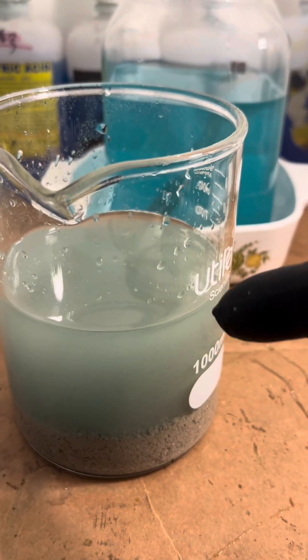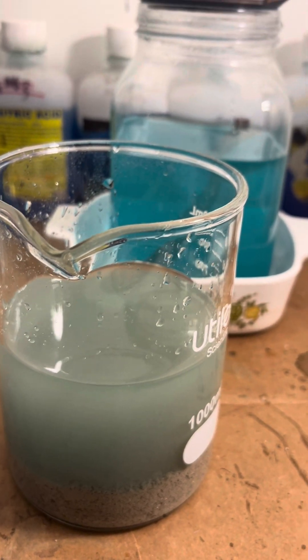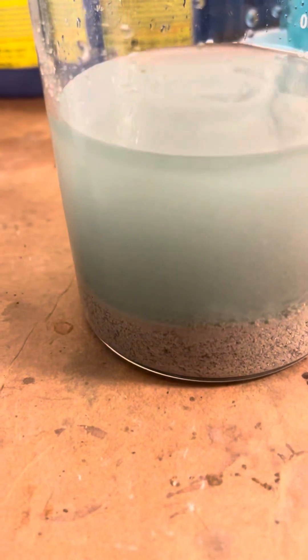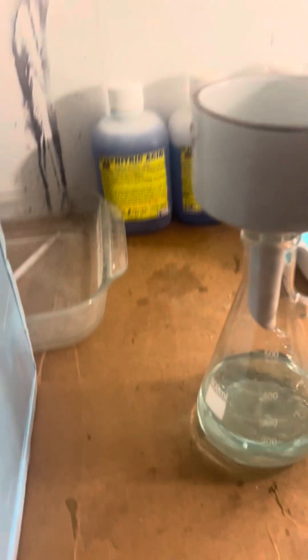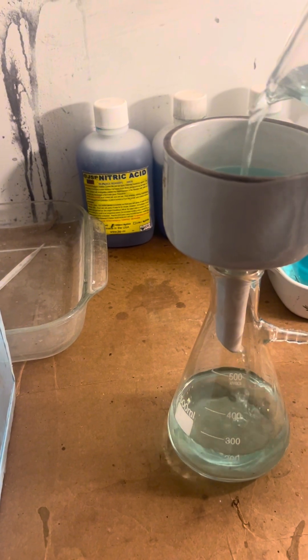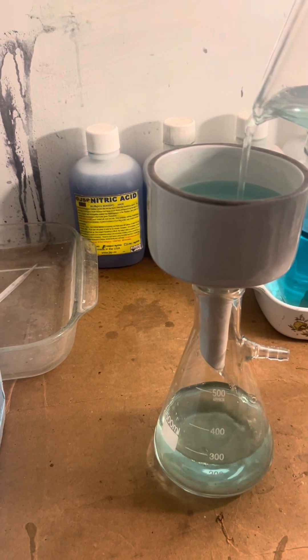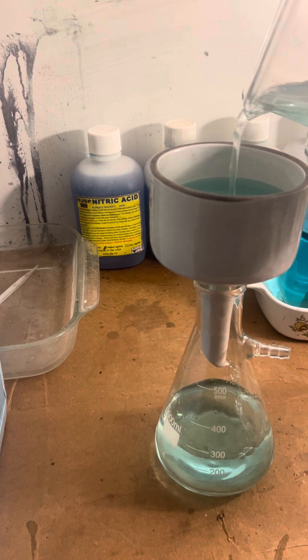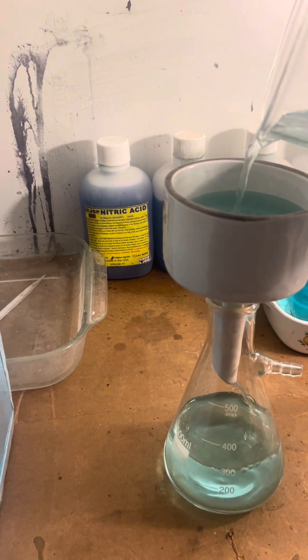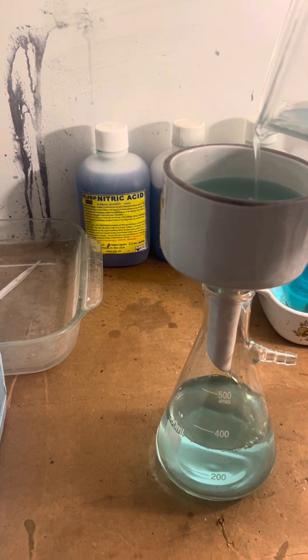We're going to start to clean that up. I'll let that settle tonight, pour it off, and give it some hot water boils. It looks 100% better. We'll get a weight on it later. We're starting to separate the silver from the top weak copper nitrate solution. I'm not going to bore you guys to death with this — I will clean it up and dry it out.